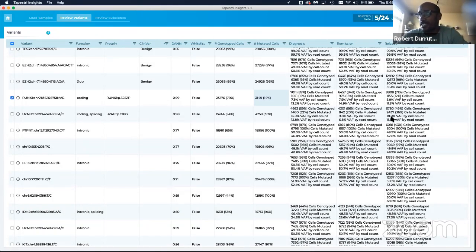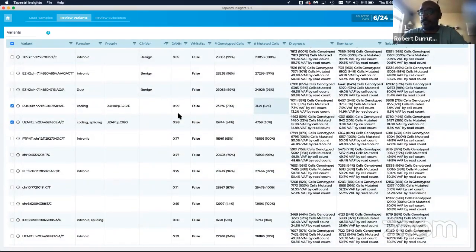And just as a guide, we like to keep the difference below 1.5x. So that's sort of a rule of thumb. If you don't expect copy number, those two metrics should not be more than 1.5x different. So let's just assume I select that, and I want to be less conservative with the variant selection at this point.